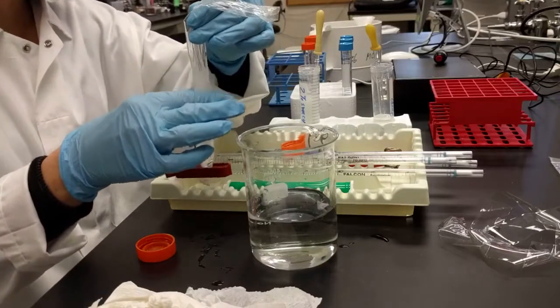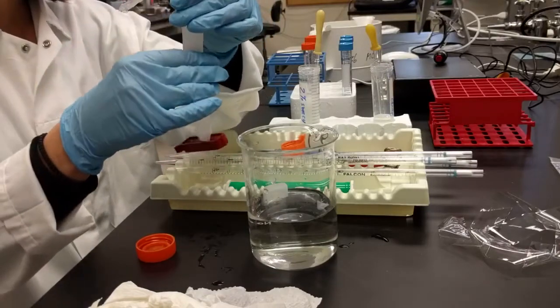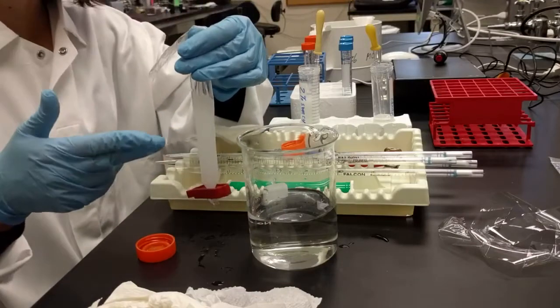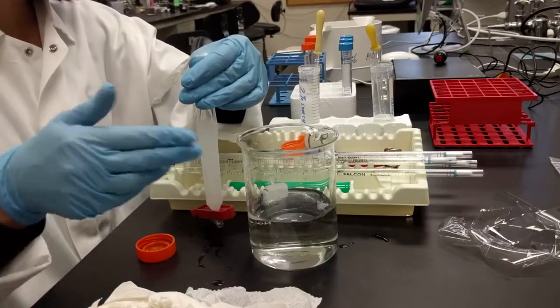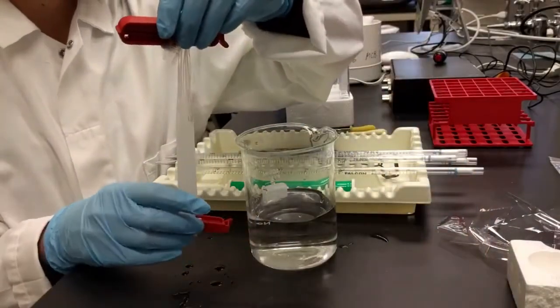Okay, so then we can kind of roll it around like that to mix up the glucose and the starch solutions. Okay, I'm gonna rinse this off to make sure there's no starch or glucose on the outside, and then I'm gonna add it into the beaker. Okay, so now we have our bag filled with starch and glucose.